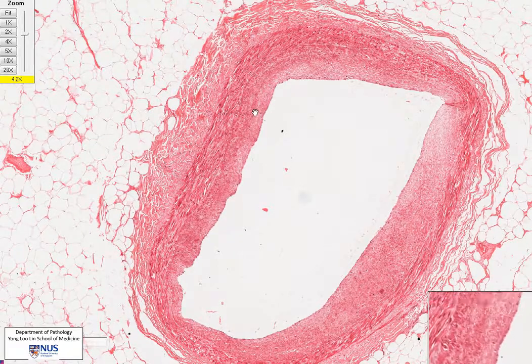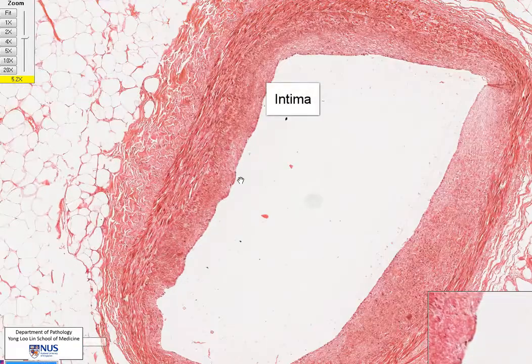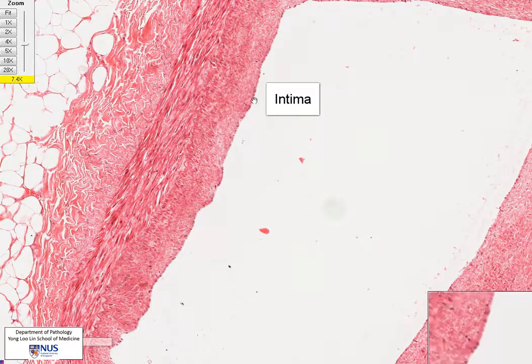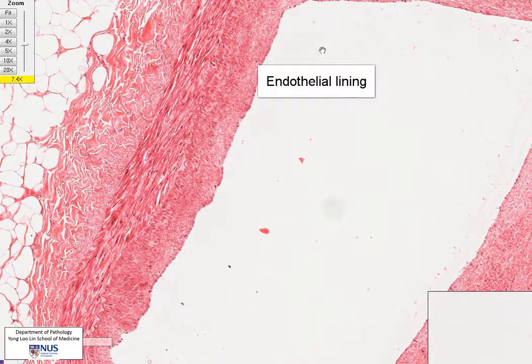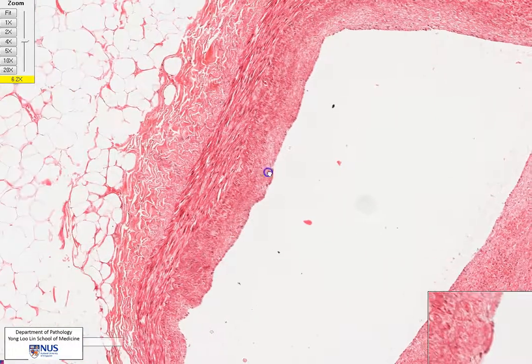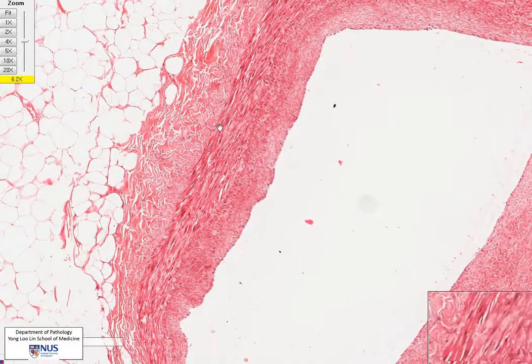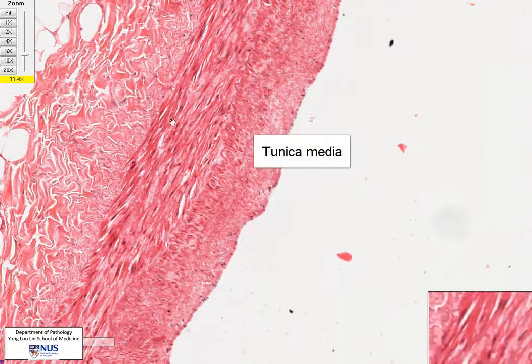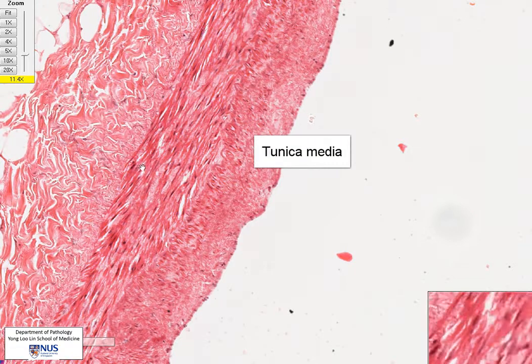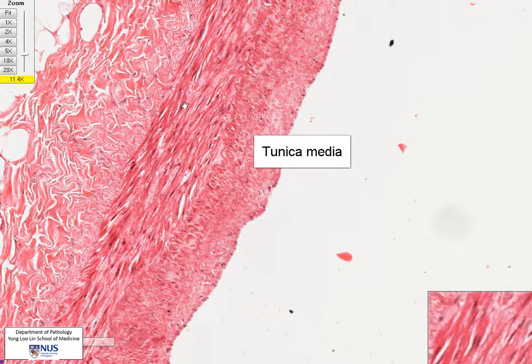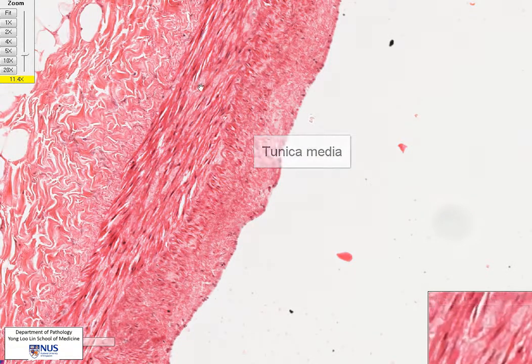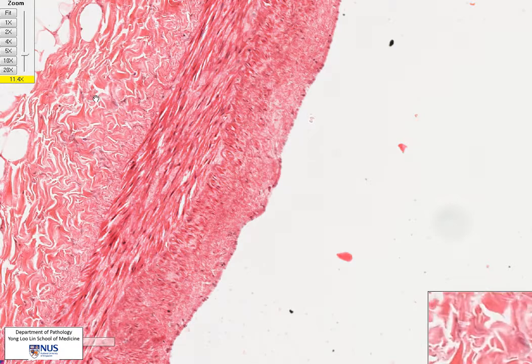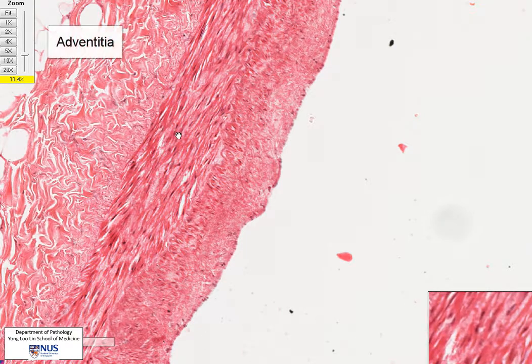The innermost layer here is called the intima, and this is lined here by a layer of endothelial cells, which is immediately present adjacent to the lumen. Just beneath the intima is the media — the tunica media — and you can see that it is composed of smooth muscle cells with central nuclei and a very spindled appearance. And then deep to that is the adventitia.